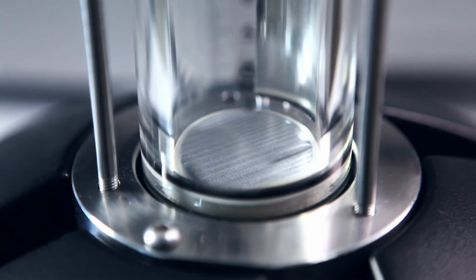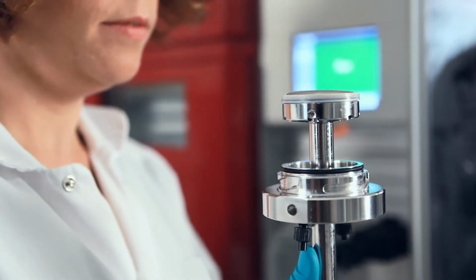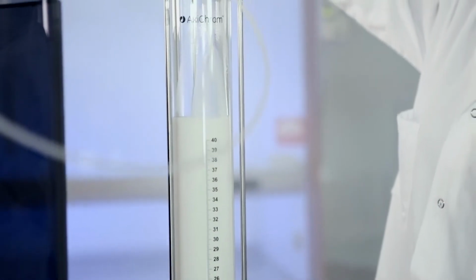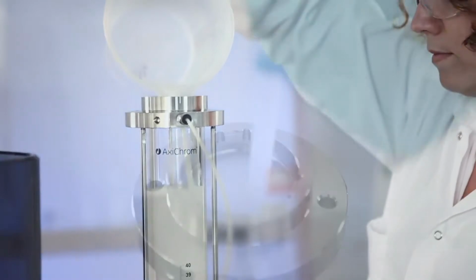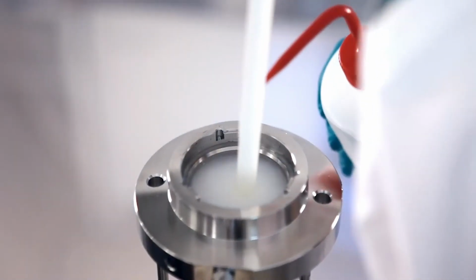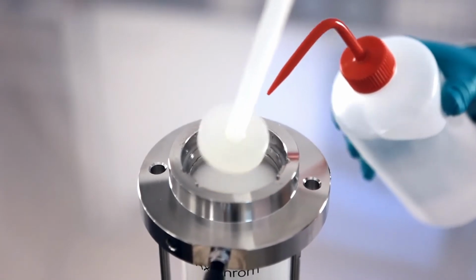Both the bottom of the column and adapter are primed manually to remove air from the bed supports and tubing. Slurry is first poured into the column and then filled with packing buffer. Use a media stirrer to make the slurry homogeneous. Rinse the media stirrer as well as the flange with packing buffer.